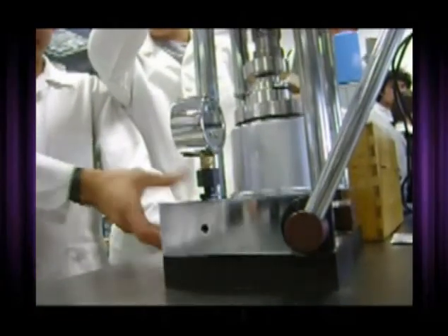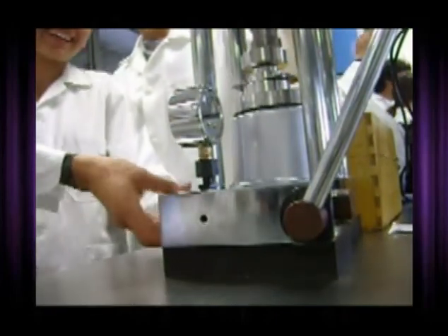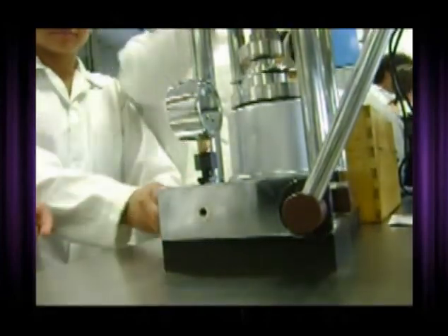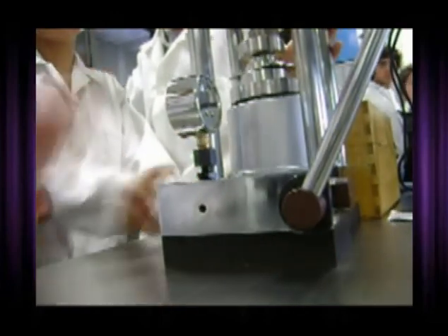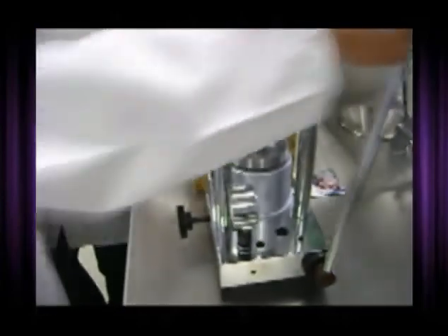For the practice we use a hydraulic press. This is a machine in which a large force is exerted on the larger of two pistons in a pair of hydraulically coupled cylinders by means of a relatively small force applied to the smaller piston. That produces a force of about 15 tons to make a high quality 13 mm pellet used for infrared solid sampling.